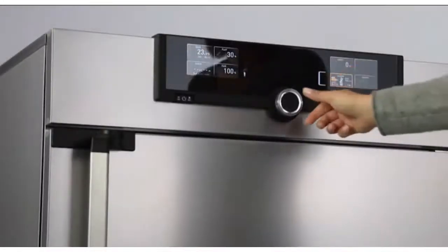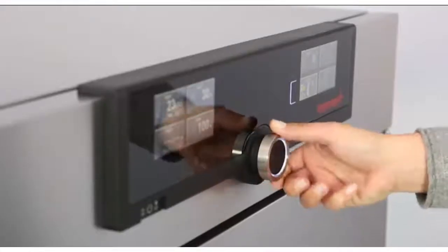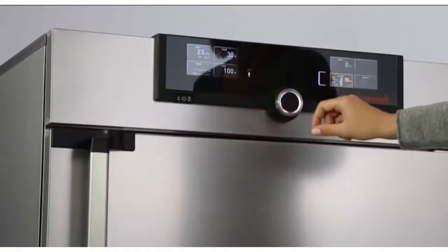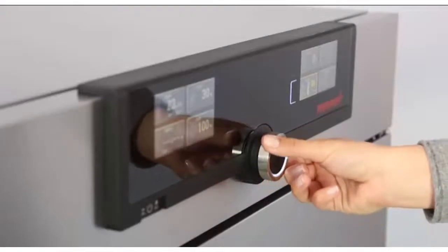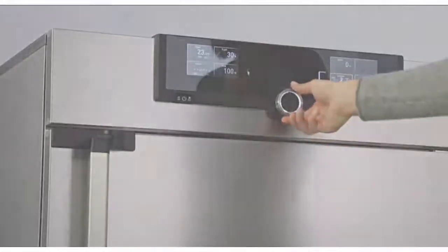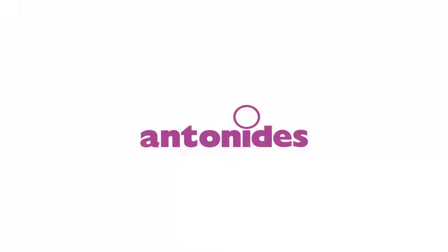In the right display you can, for example, set temperature monitoring or apply specific parameters such as CO2 and humidity. And go.